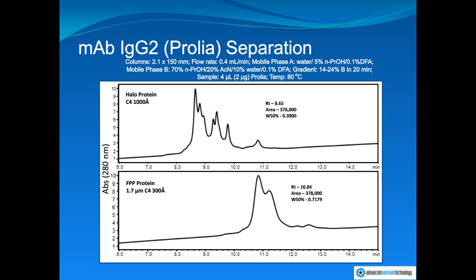We have not characterized all of these variants. There's clearly a lot of variants of the IgG2 present. We're having to go in and collect all of the variants that we can access and tryptically digest and analyze all of those. What I can tell you is that across that peak, looking at the Orbitrap data, these are all, in fact, pretty near or very close to being proven as isobaric structures.